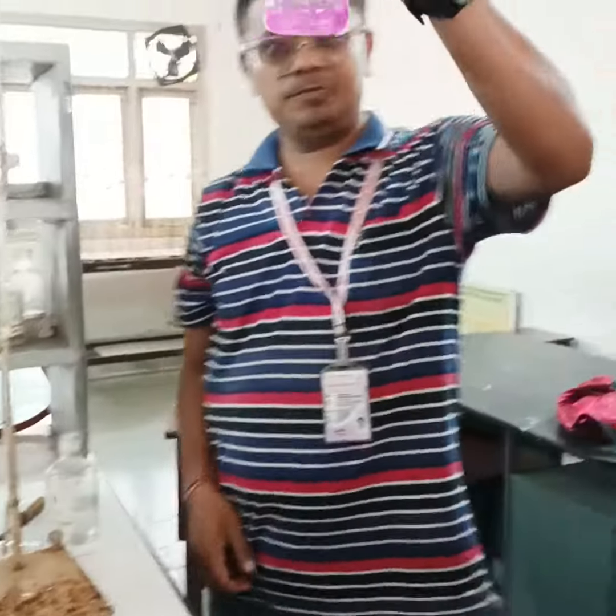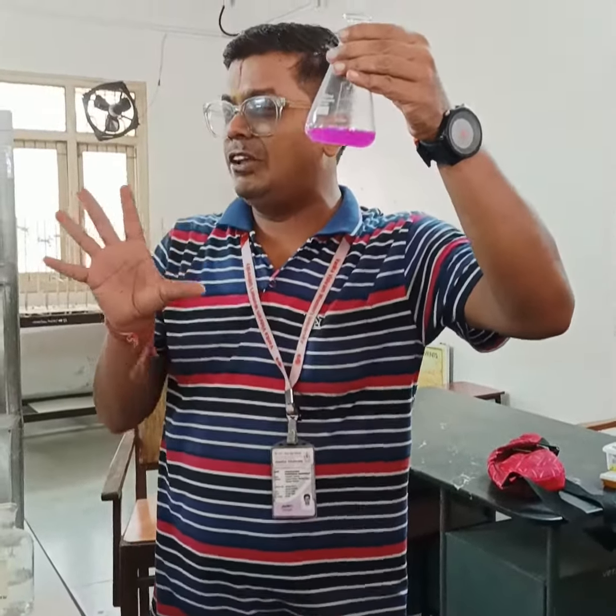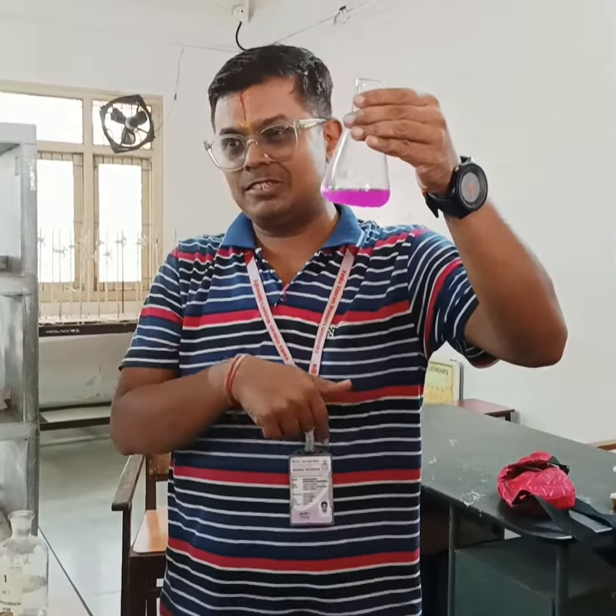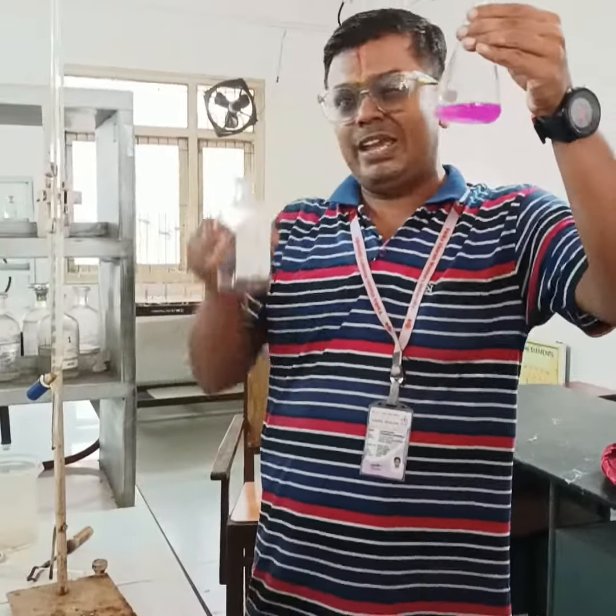I will add more here. But it gives the wrong result. If you add more, it does not mean that a dark color means the result is correct. No, you have added excess. Got it? If you add excess, the color shows your reaction is wrong. Suppose I add HCl again, what?